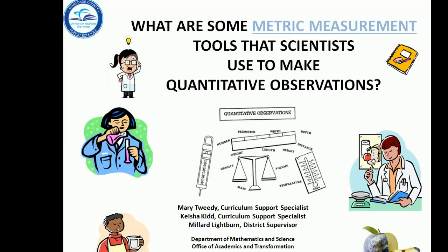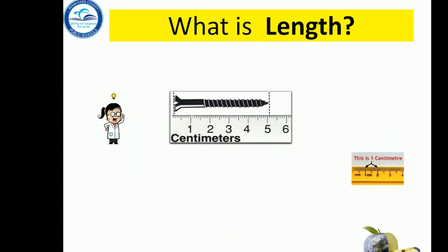Hi, today we're going to be looking at metric measurements and the different tools that scientists use when they are working in a laboratory and things that you'll be using as you work through your laboratory experiences as well. So the first thing is, what is length?